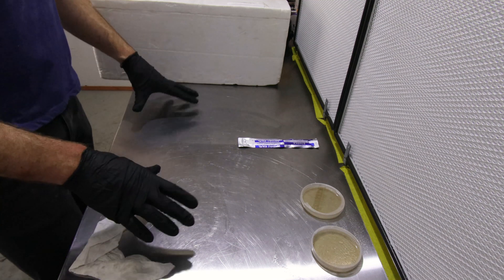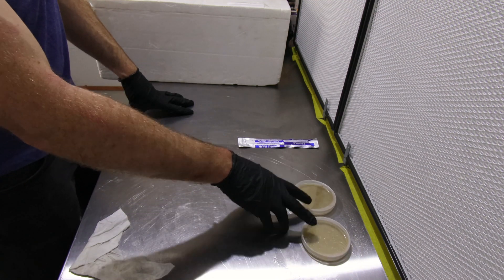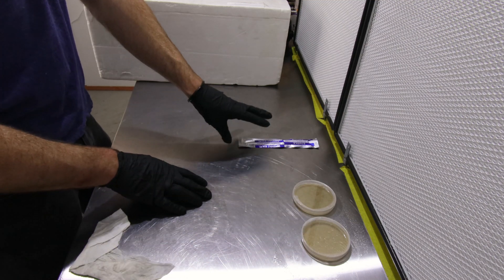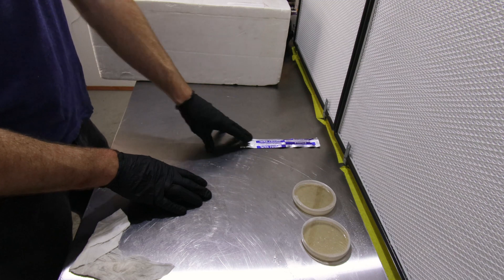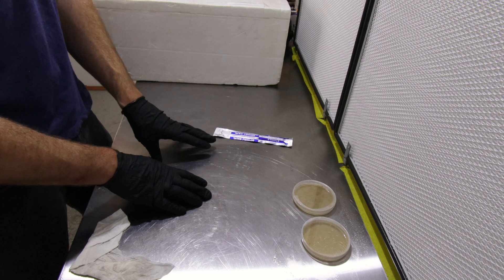I've got my workspace ready. I've got two pre-made petri dishes of agar, a sterile scalpel, and the mushrooms I collected today. We'll get one of those out and use it.